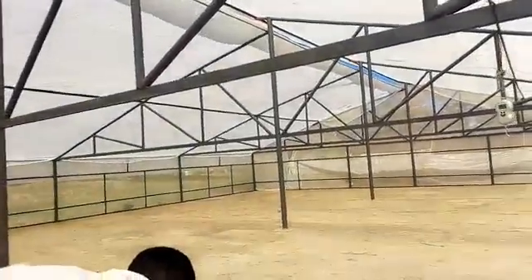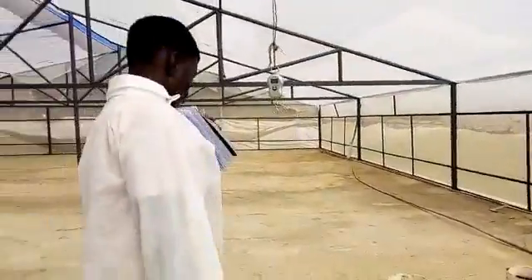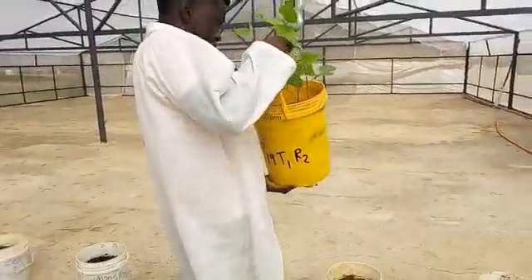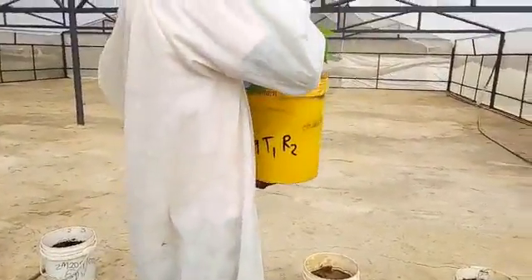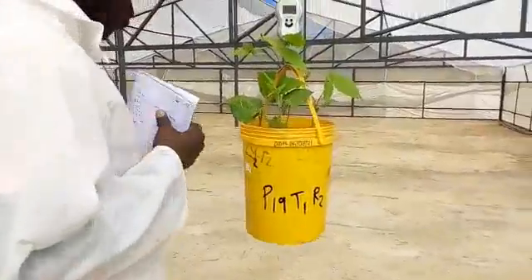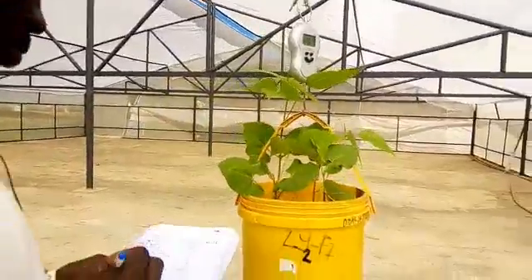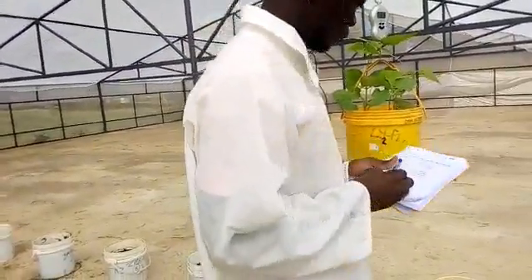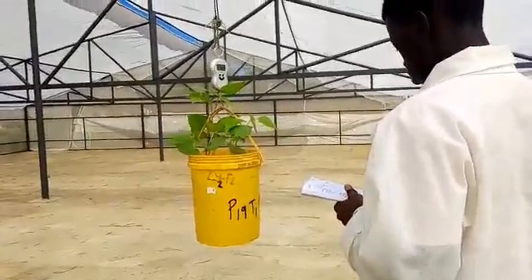There's always a difference in percolation, and so that's why we need to weigh each treatment so that we do not give them what they do not need. That would cause flooding, or stress if it's less. What treatment is that? That's treatment 1, Liambai, that we are weighing right now, and the reading is 11.60 kgs. Okay, so that's our task 1 this morning.